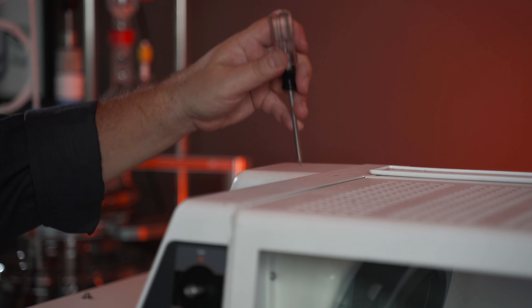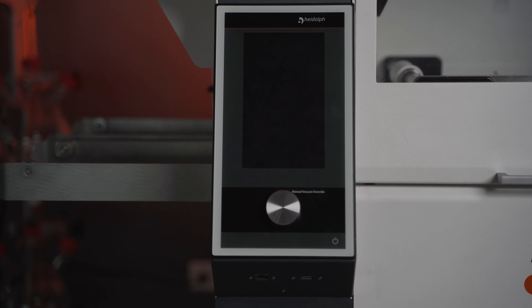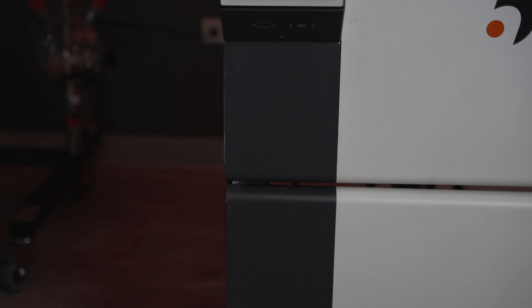Once you have your lock knob removed, the next thing we're going to want to do is remove the front panels of the unit. There are three panels: there's one up on the top, then you have your control panel, and then you have this panel here.